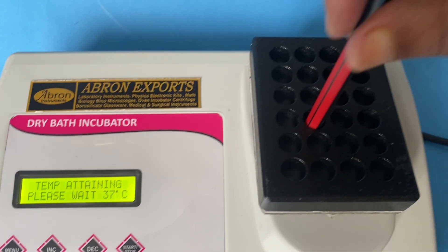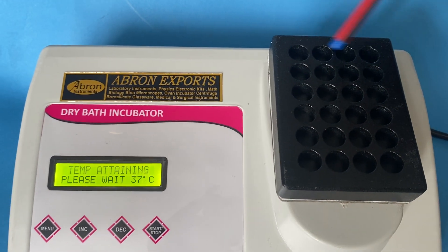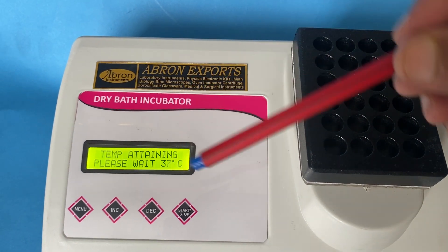There are test tubes — you can put the test tubes. It comes with slots; 24 test tubes can be placed in total.